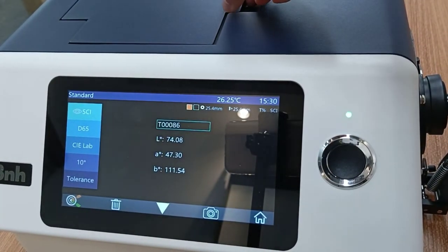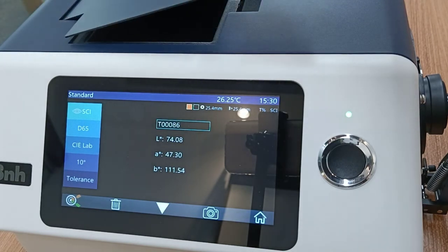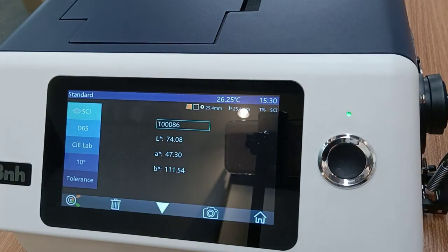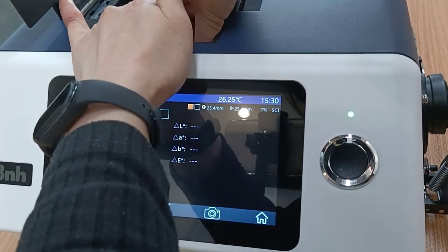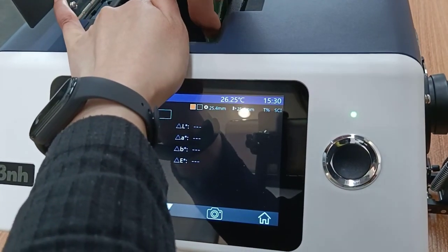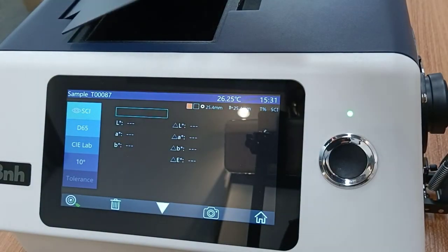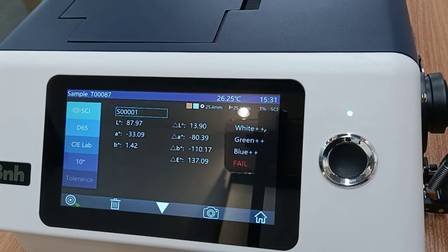This demonstration shows that we need to use the transmission mode when measuring transparent products. Then we test the sample, and we can see the difference between the two liquids.